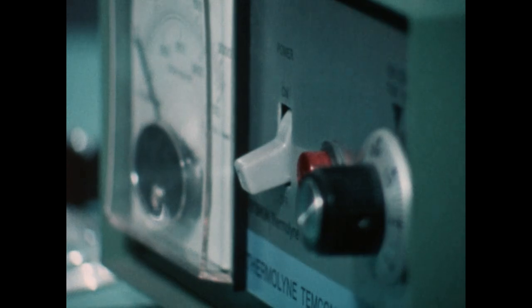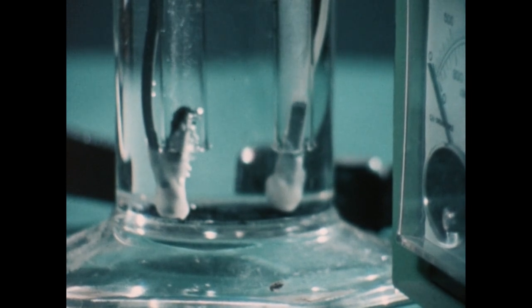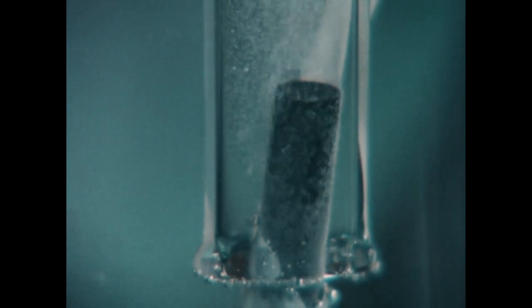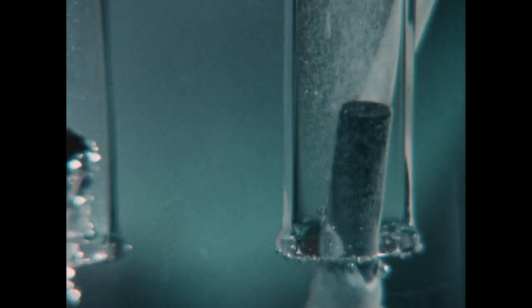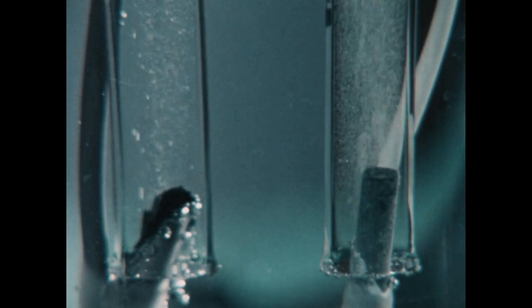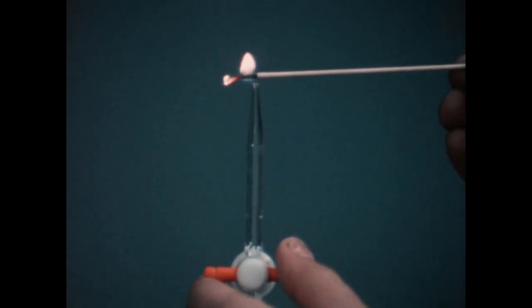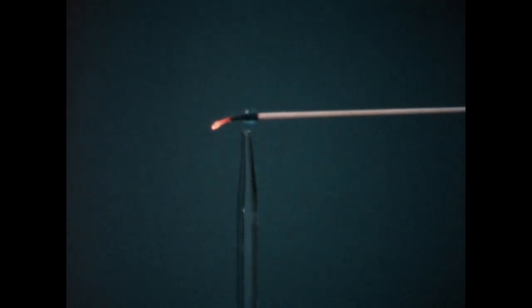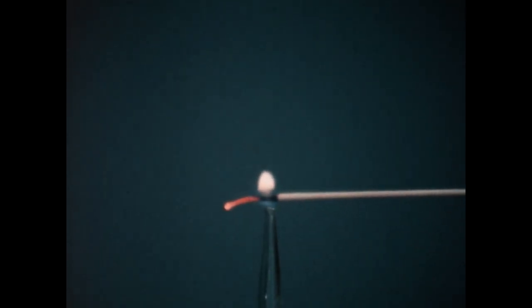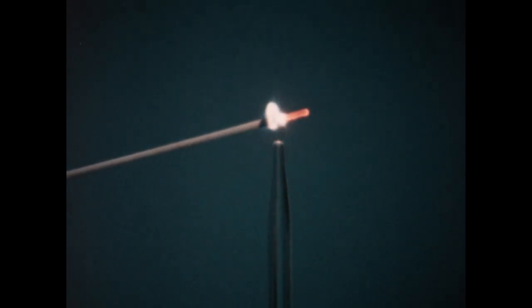If we pour water into an apparatus like this, we can force an electric current to pass through the water between the electrodes. And this time, the bubbling is the result not of a physical change in the water, but of a chemical change. Gases are forming at each electrode. One of the gases produced from the water burns. The other one doesn't burn, but it supports combustion.